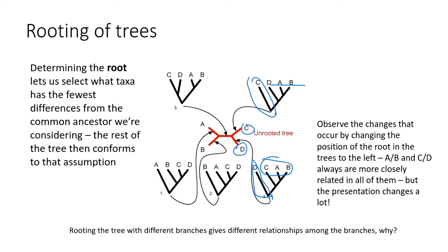So you can convert this unrooted tree into multiple versions. And how do you know which one is correct, right? You wouldn't know which one is correct. So in order to root the tree properly, we add a sequence of a virus that is related to coronaviruses, but it's not close enough. So it's like a control that will not cluster or form these related groups in one clade with your coronavirus, and is there for you to say this is a root.